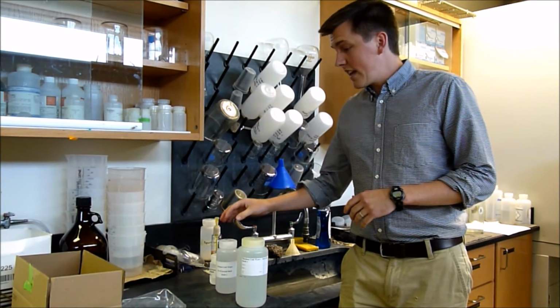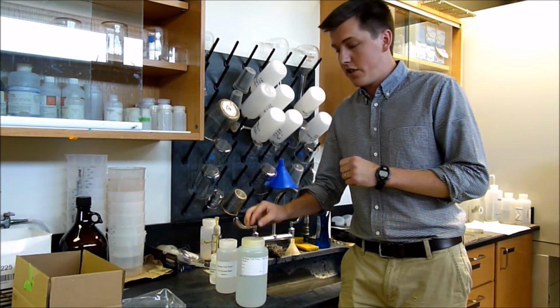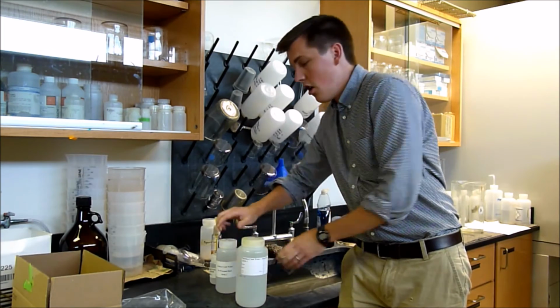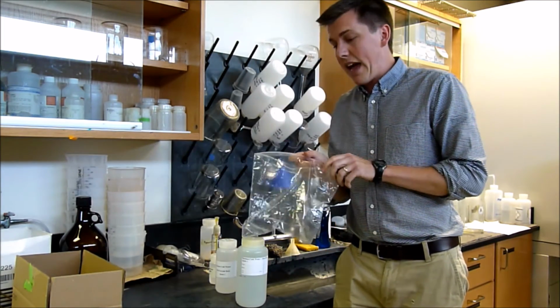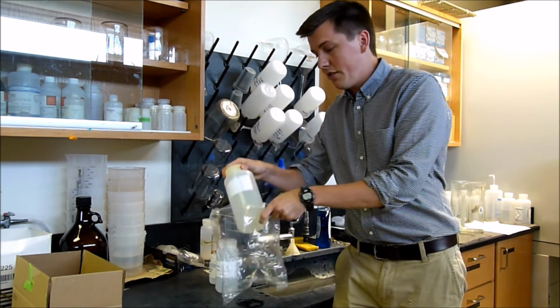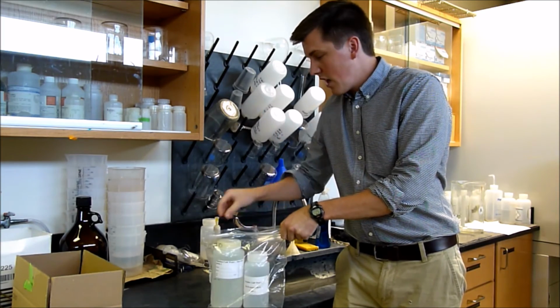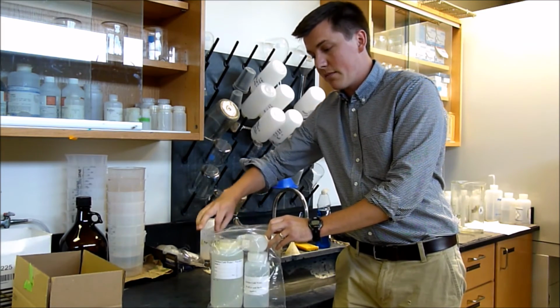Now that we've collected and capped our bottles, it's time to repackage them to send them back to Virginia Tech. And before we do that, we just want to make sure that we firmly tightened all the tops to our bottles. It's a little tricky to get all 3 bottles back into the bag, and so the way that you do this is to put the largest bottle in first, the medium-sized bottle next to it, and then the small bottle needs to lay on top of the medium-sized bottle.